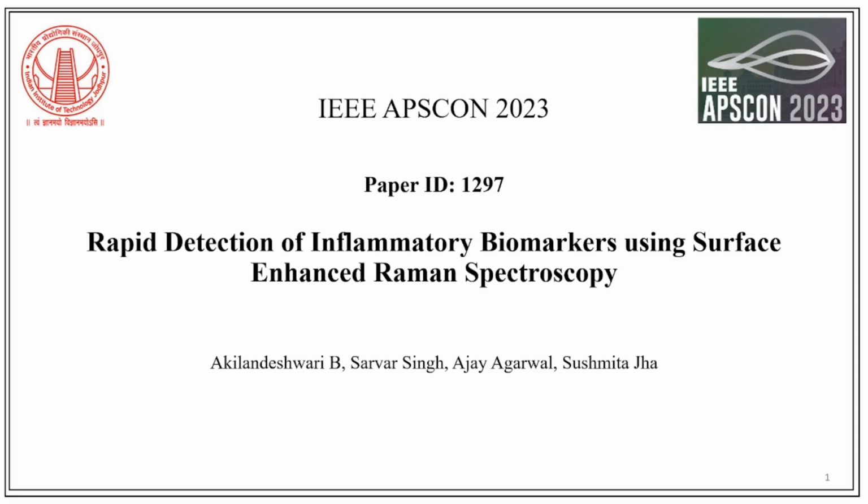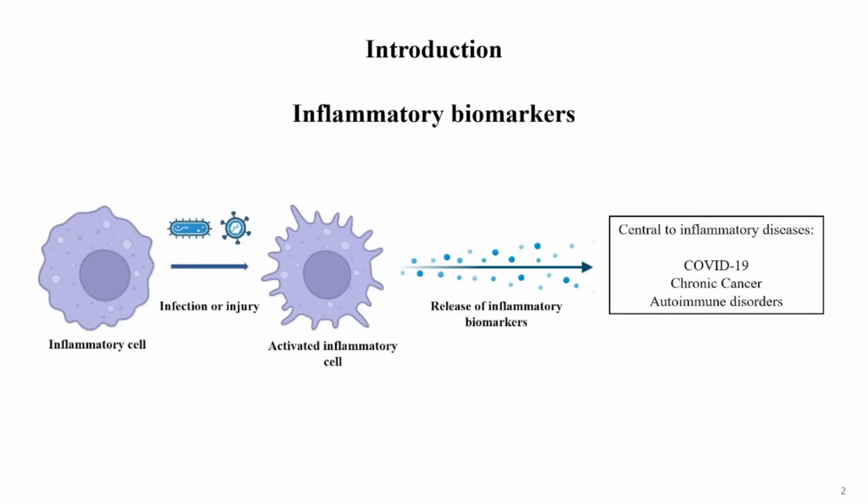So, the title of my project was Rapid Detection of Inflammatory Biomarkers using Surface Enhanced Raman Spectroscopy. So, let's make it easier for the audience here. I would like to split the title into simpler terms and make you understand. So, first, I would like to talk about what are inflammatory biomarkers.